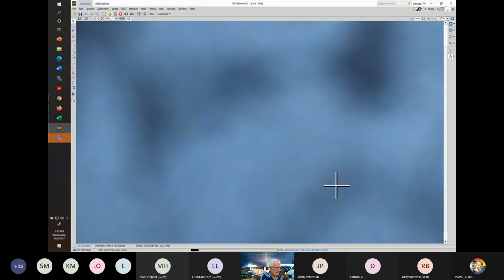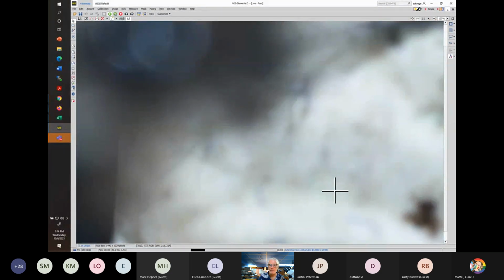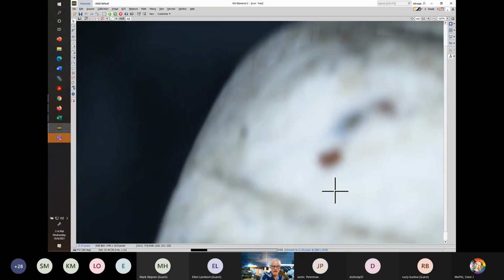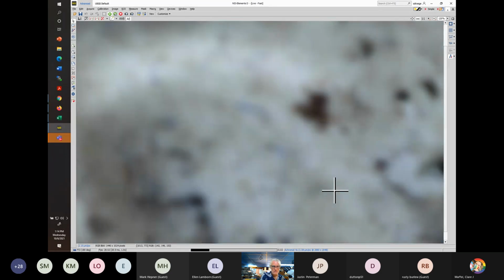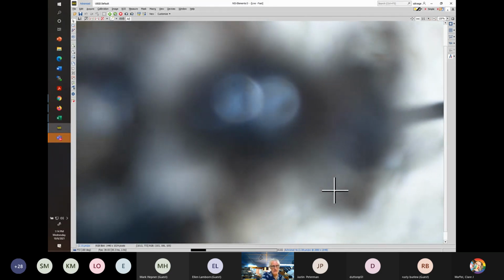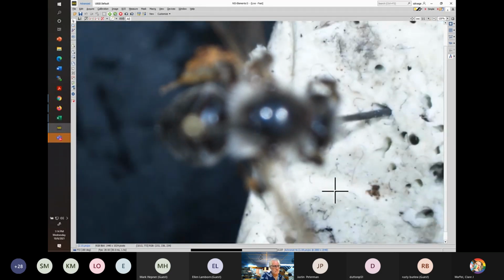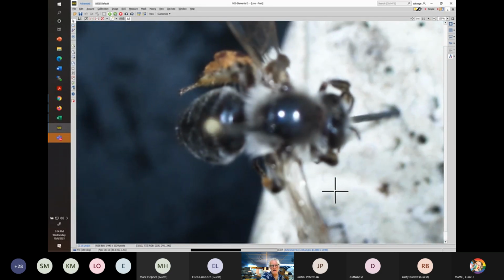And I just snapped something off that specimen. Oh, a leg. Darn it. That's what happens when you try to move too fast with dried specimens. So we're going to zoom back up here. And we'll go to the guide now.